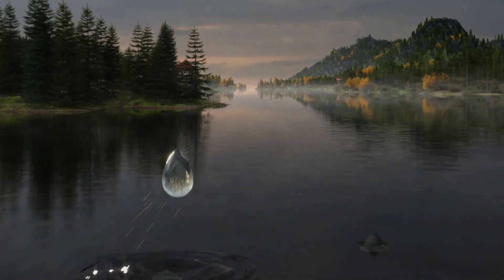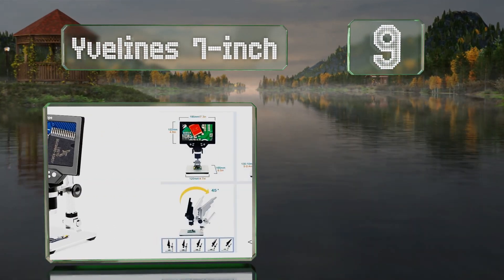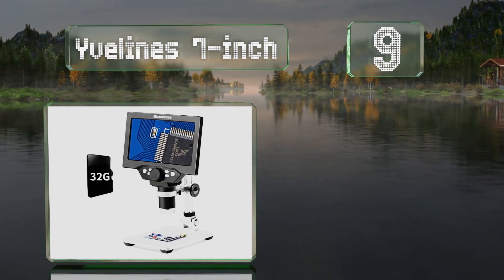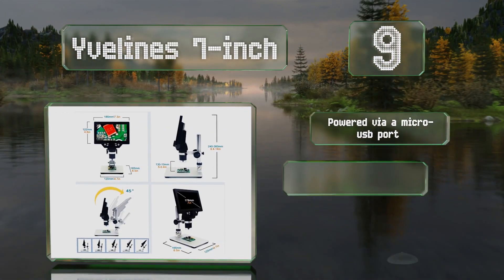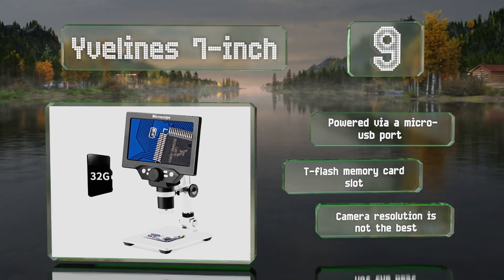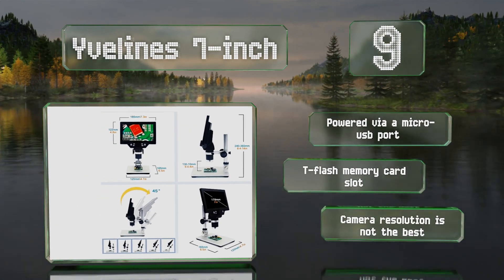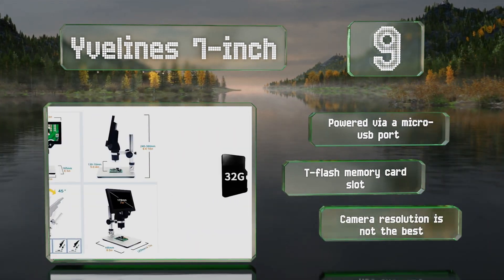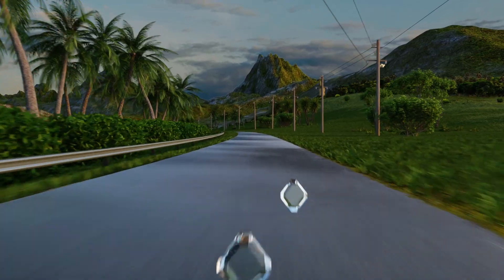Starting off our list at number nine, offering a magnification of up to 1200 times, the Eve Line 7 inch is ideal for everything from biological samples to printed circuit boards. It features a high definition LCD screen mounted on an adjustable bracket that offers a front-to-back tilt of 45 degrees. It's powered via a micro USB port and includes a T-Flash memory card slot, but its camera resolution is not the best.